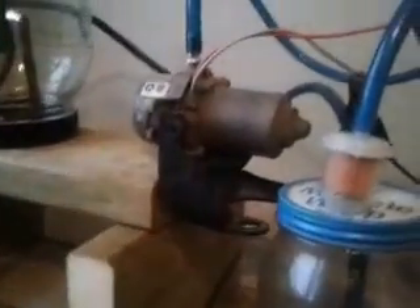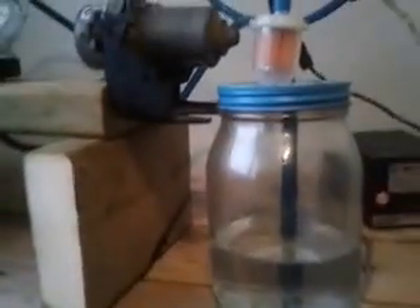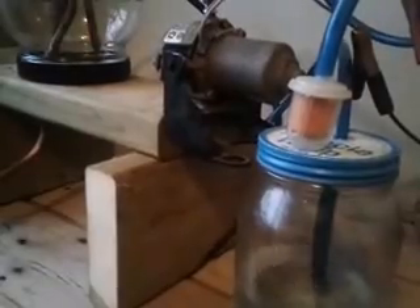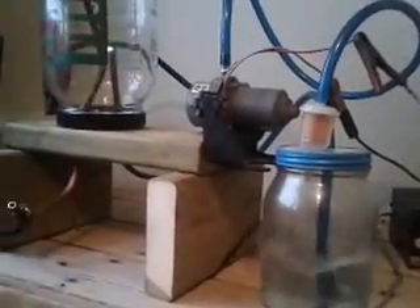I'll go ahead and switch this on. I think this pump must have an internal vacuum switch or something — it seems to kind of run and then shut itself off. I'm not sure it's going to work the best for me, but there we go.